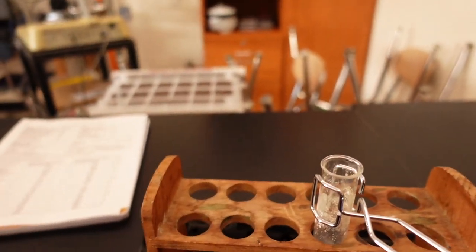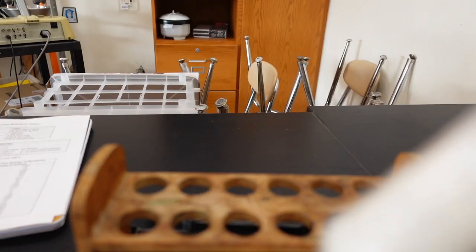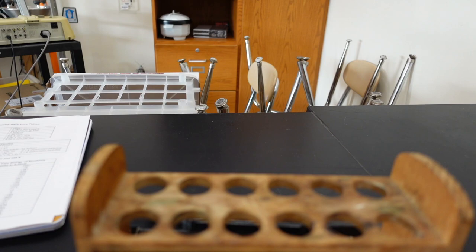Now, because every substance has its own unique melting point and freezing point, the same temperature, by melting this and letting it cool, you'll be able to figure out what the freezing point temperature is and therefore be able to figure out what this white waxy substance is.